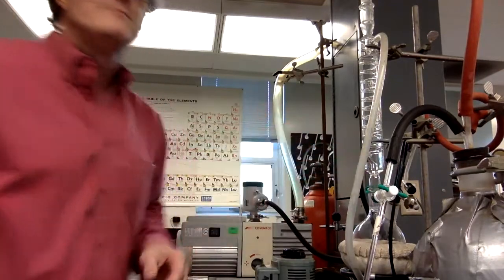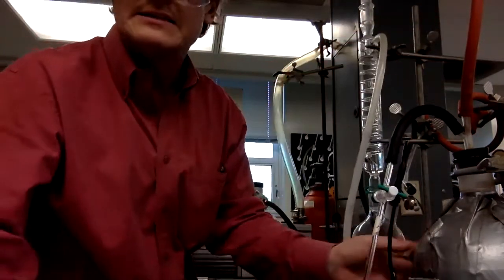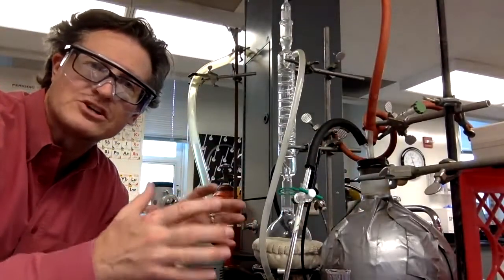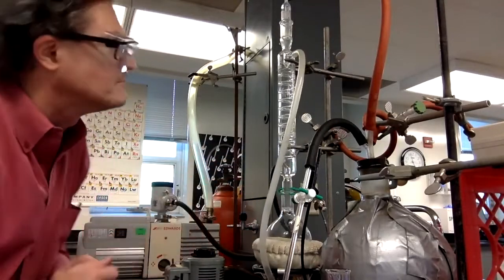You can hear that everything's pumping down. Sounds good, right? We're pumping down the ballast. The ballast is here to provide a bigger volume to the system. It provides a cushion and a time constant so that the pressure doesn't jump up and down too much with changes that are going on in our system, all right?